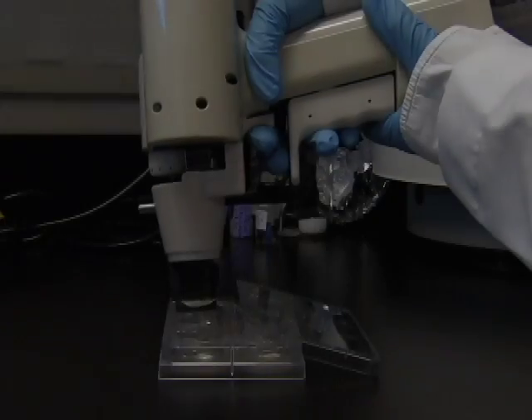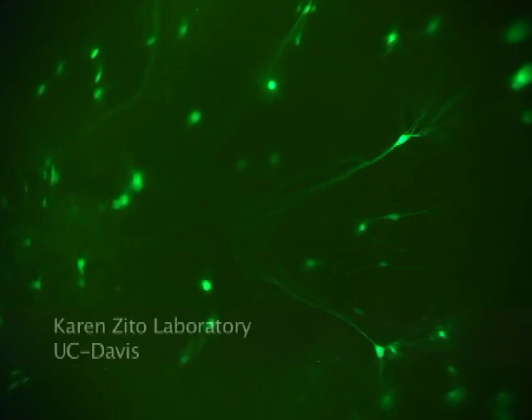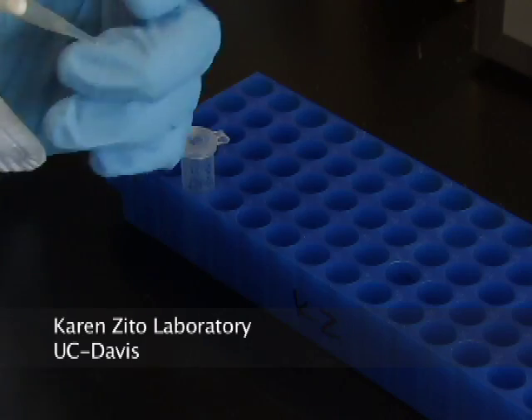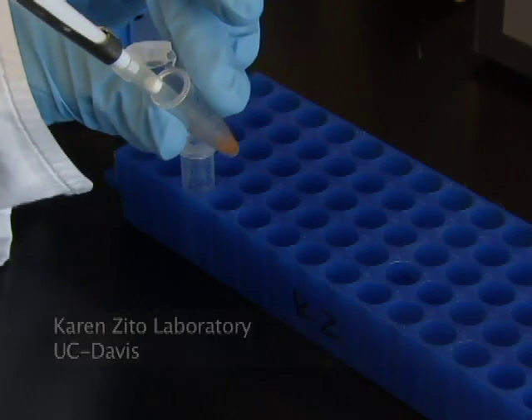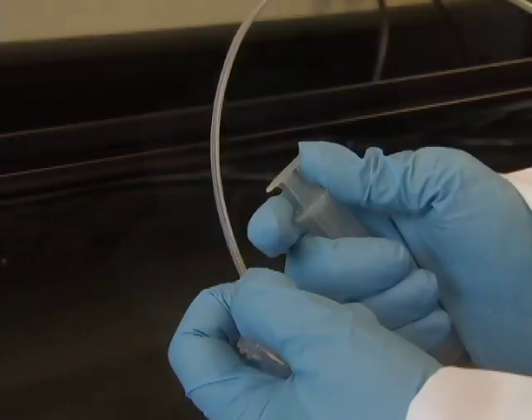DNA-coated bullets and how to perform biolistic transfection on rat hippocampus slices. The basic steps underlying biolistic transfection are: one, coat gold particles with the DNA to be transfected; and two, coat the inside of the plastic tubing with this gold.